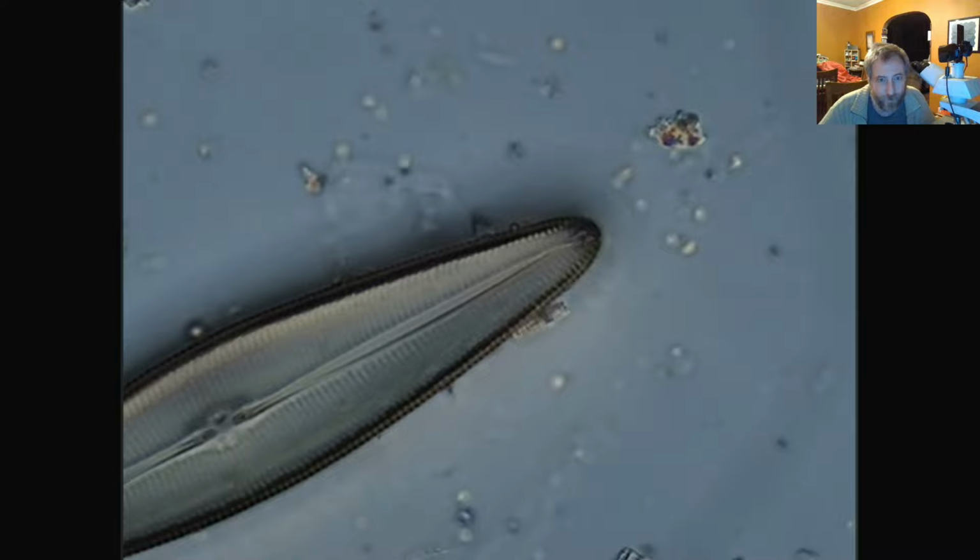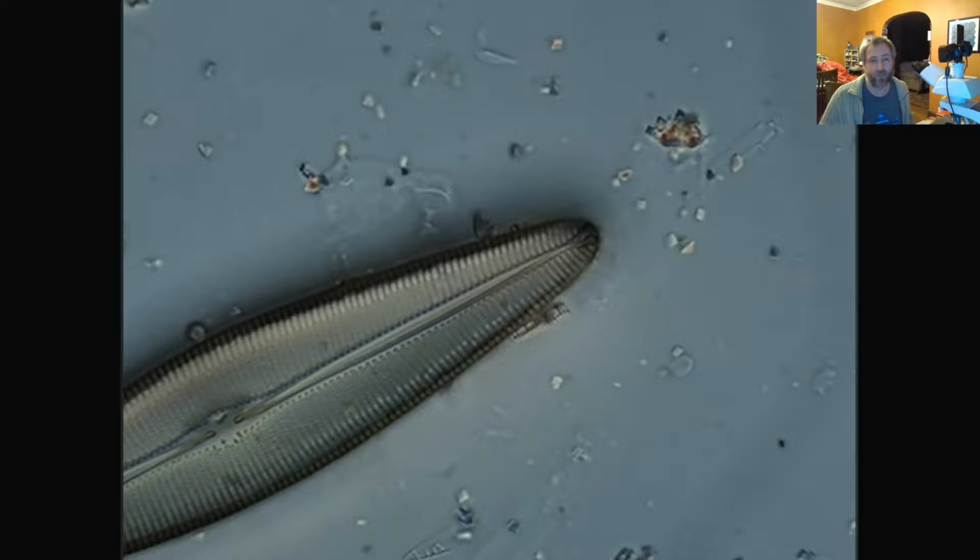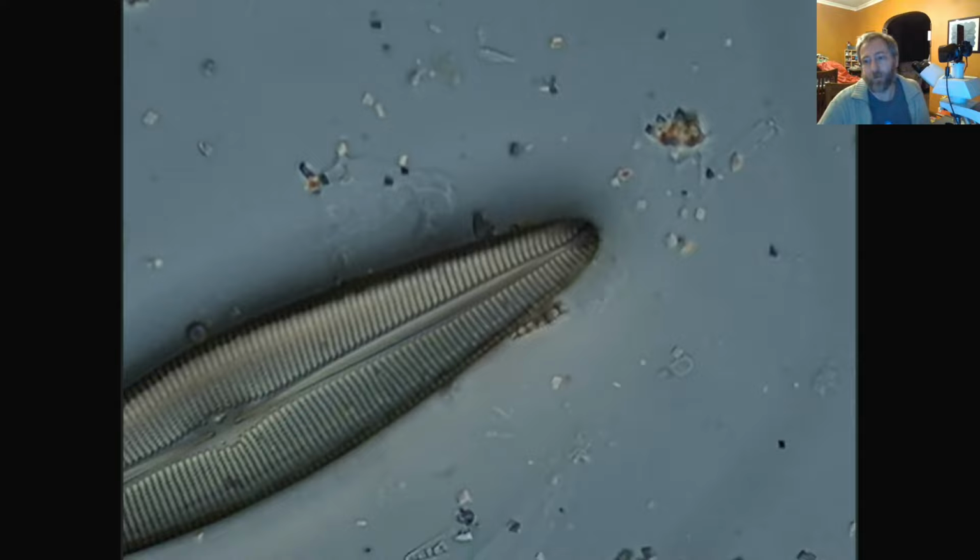But if I actually start to focus through the diatom, right there, you can see sort of a thickening at the top, and then there's sort of a dark line that's inside of that thickened part. And that's actually a piece of plate of silica that's at a different focal height. So you can deconstruct what the inside of the valve looks like even without an SEM using a light microscope and a little bit of optical dissection, where we can basically separate individual planes out and figure out what was going on. So that septum or pseudoseptum becomes visible at that elevation, and then it's not visible when we're looking at the surface, but you can see the axial plate or the appearance of those lattice axial lines running down the valve. Okay, yeah, optical dissection, that's what I do.